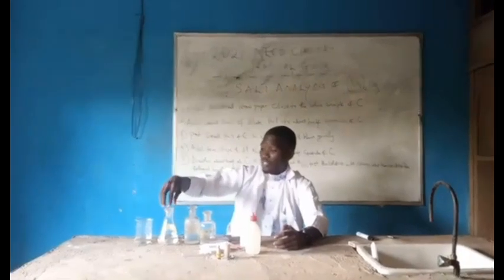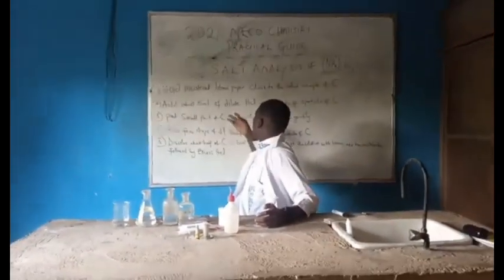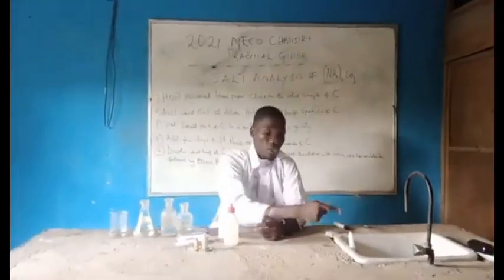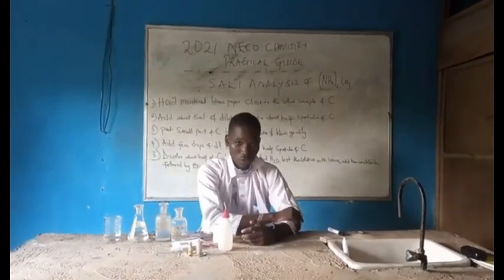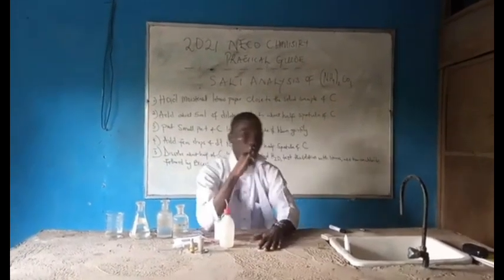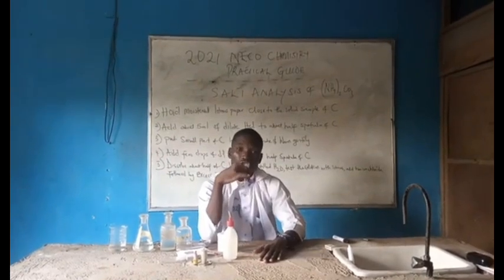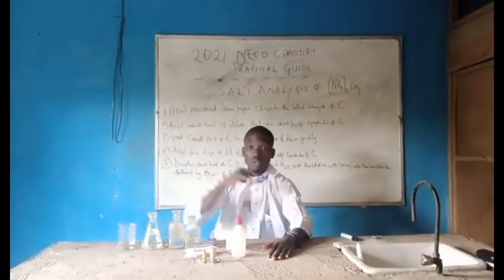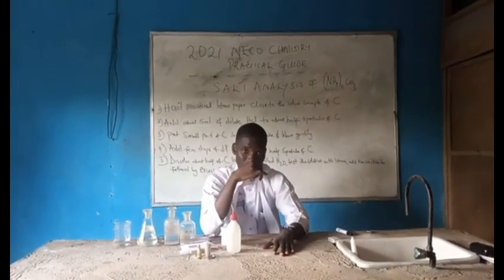Then, after the sodium hydroxide, because we are not provided with a boiling tube here, or warm water, I'm going to improvise by using this candle in place of the Bunsen burner. So now, when you pour your sample C into this test tube, before we carry out the experiment, a few drops of dilute sodium hydroxide plus heat.